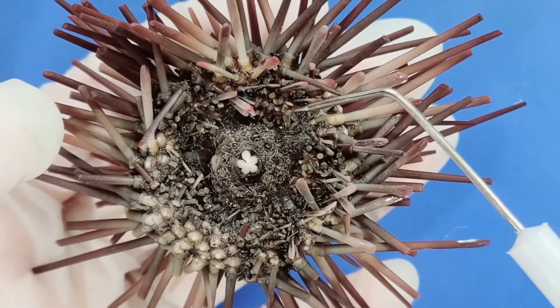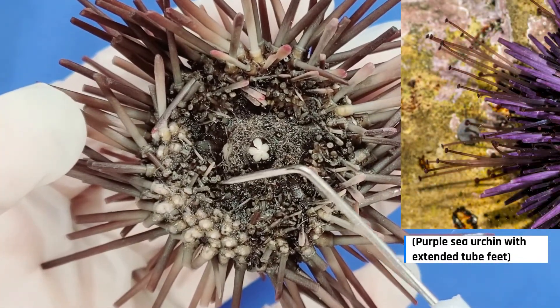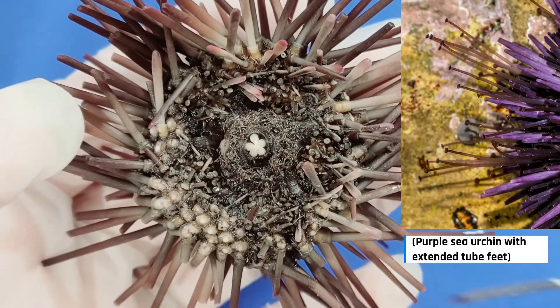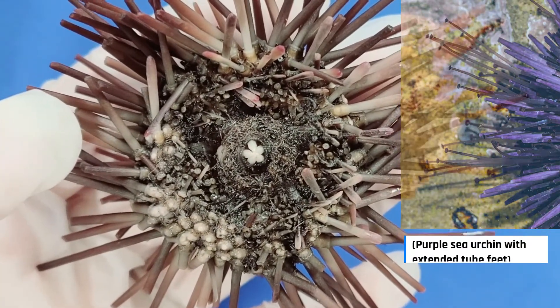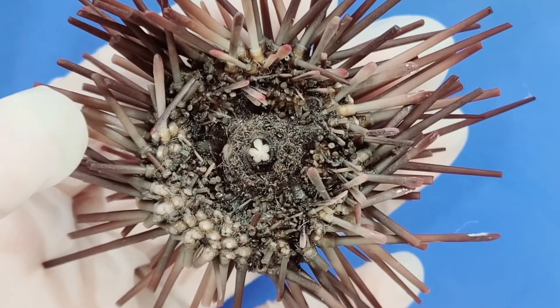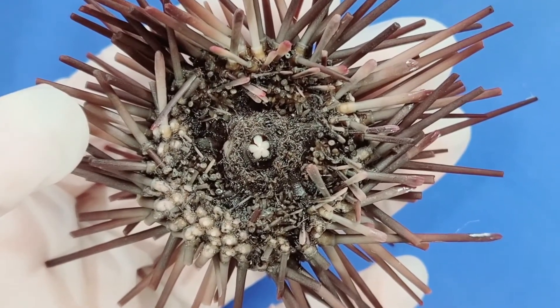The oral side of the purple sea urchin also has tube feet. Tube feet are operated by a water vascular system, which works through hydraulic pressure, allowing the sea urchin to pump water into and out of the tube feet.